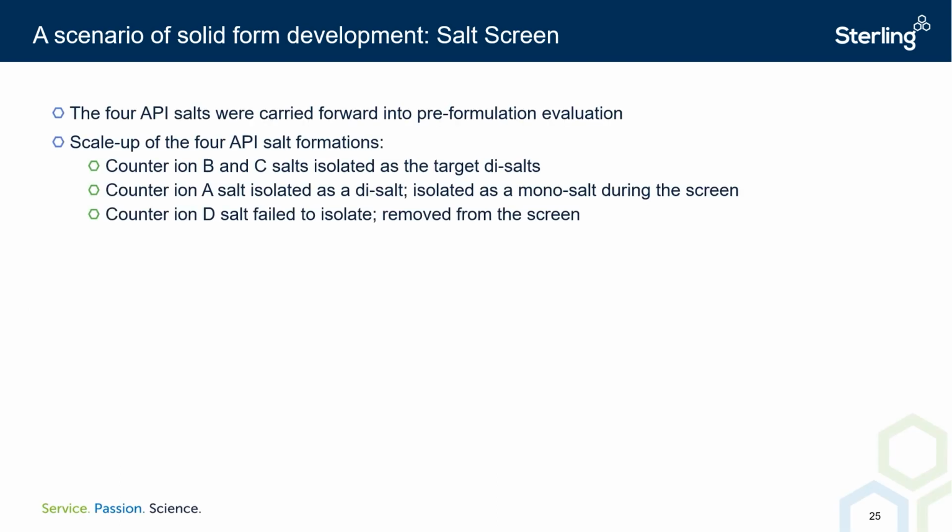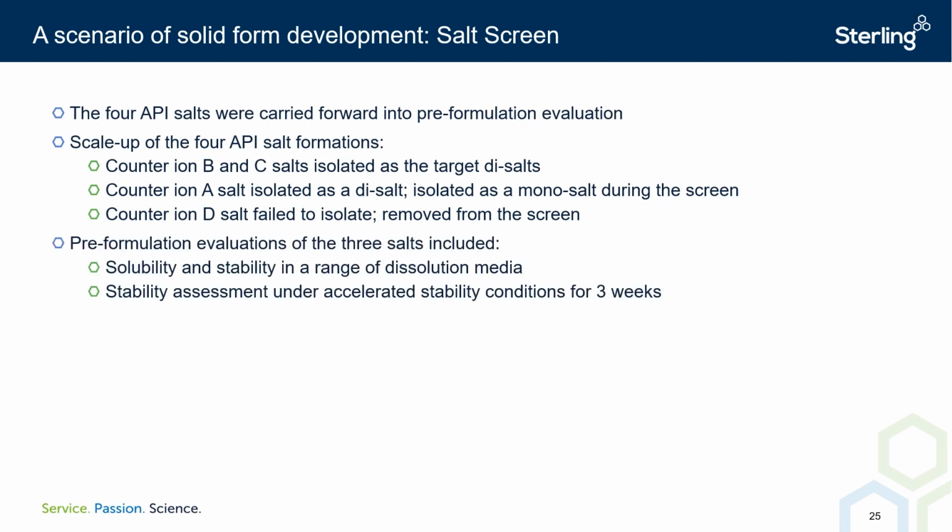To aid salt version selection, the 4 API salts identified were carried forward into a pre-formulation evaluation in order to discriminate and identify the preferred salt of the API based upon solubility and accelerated stability assessments. To support these evaluations, further quantities of the salts were required.